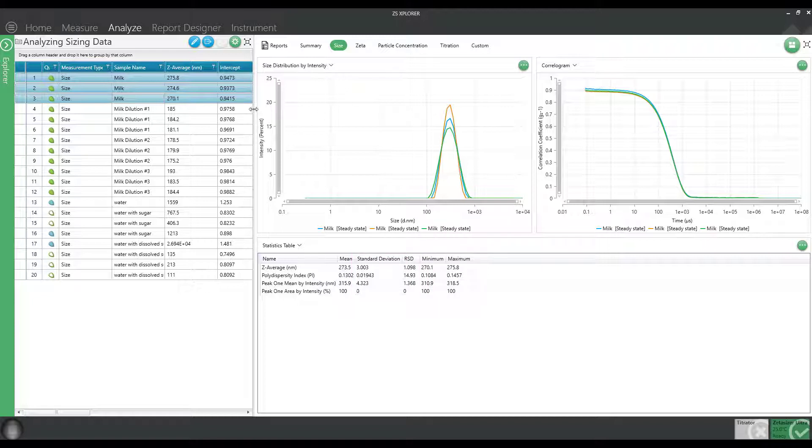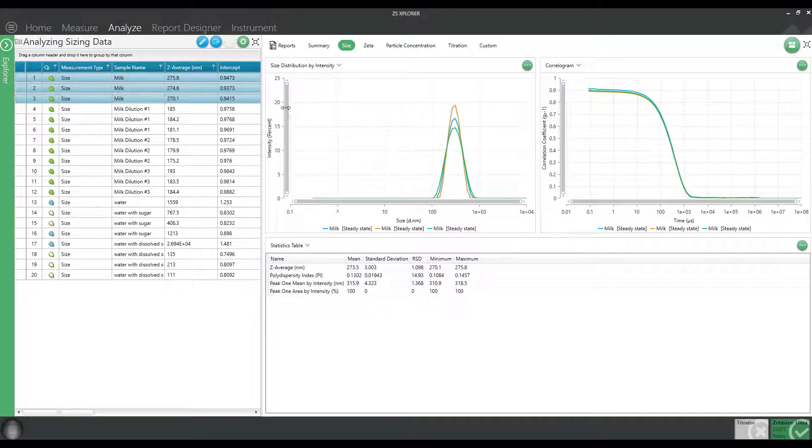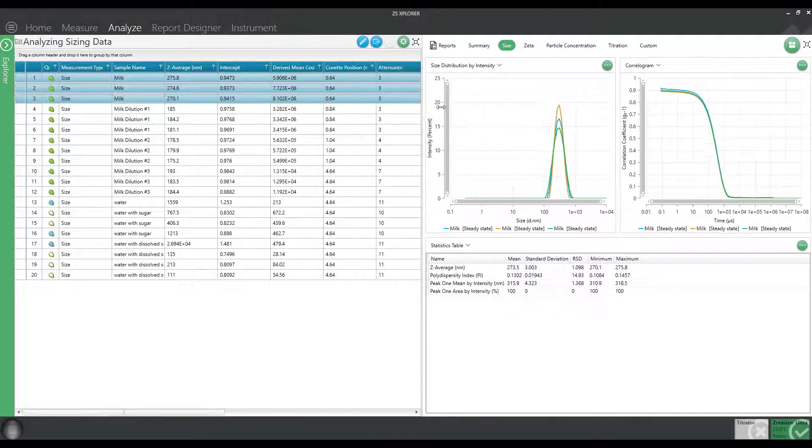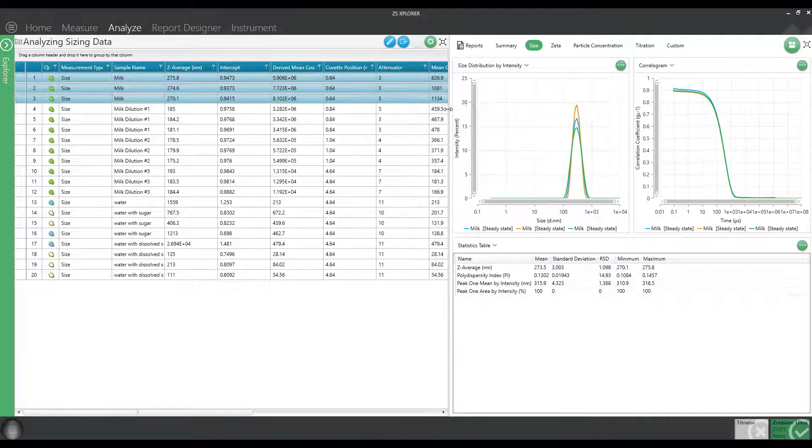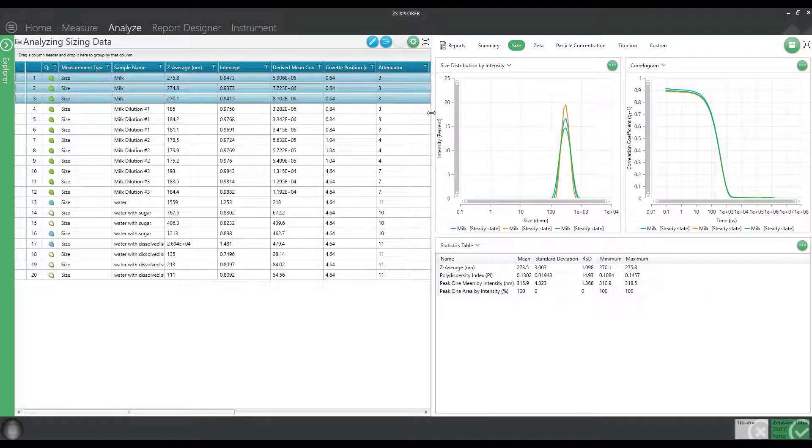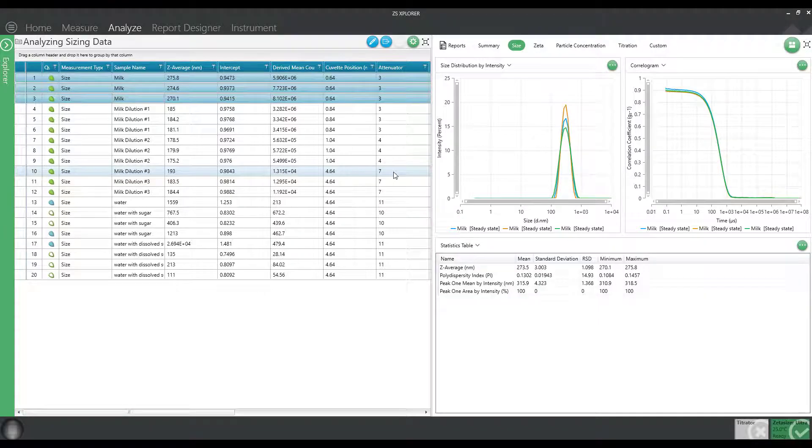However, if you look to the record view, you can start to display a couple different values that may give you hints about the concentration range relative to the instrument.